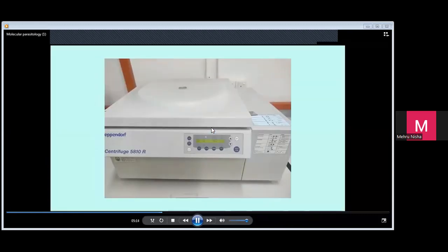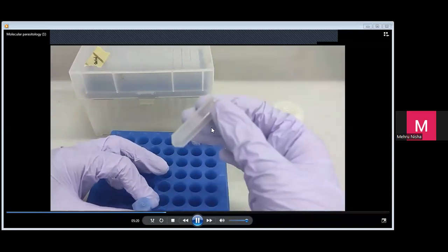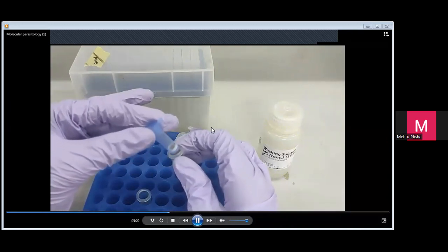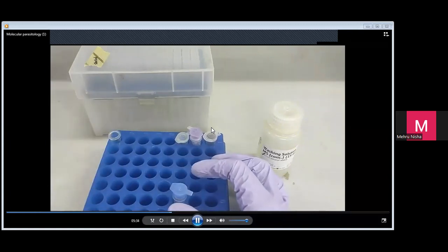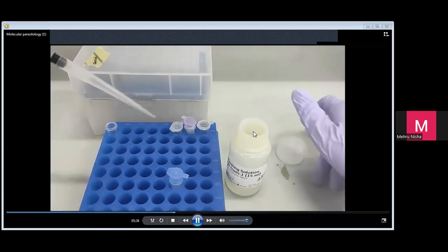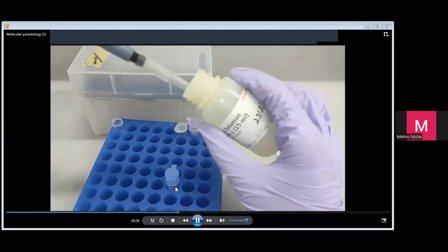Okay, so proses DNA extraction ni you will need a few times of centrifuge. So what she's explaining is the final wash solution, you will actually get DNA at the end of the tube after using the elution buffer.